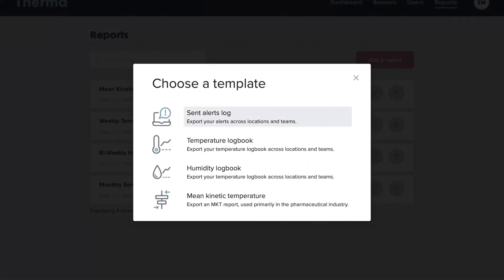The Sent Alert Log exports each alert that was sent, including the sensor name and recipients.